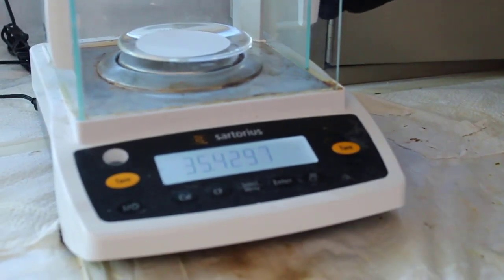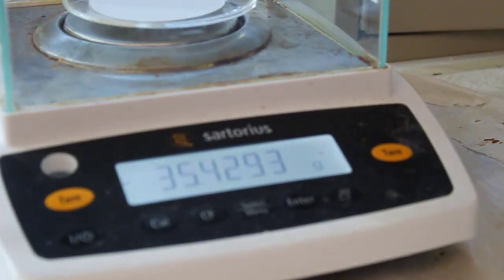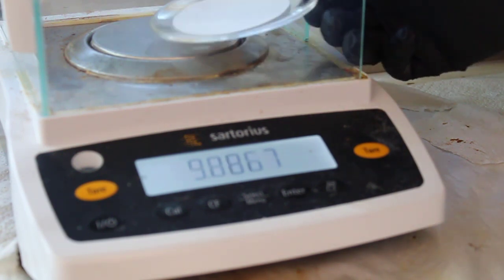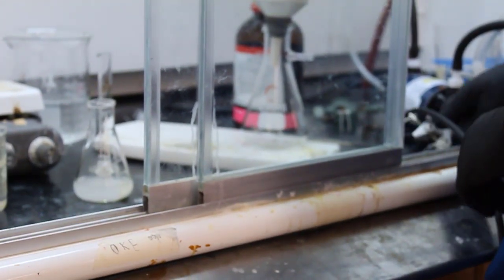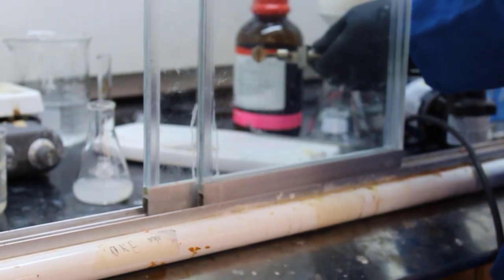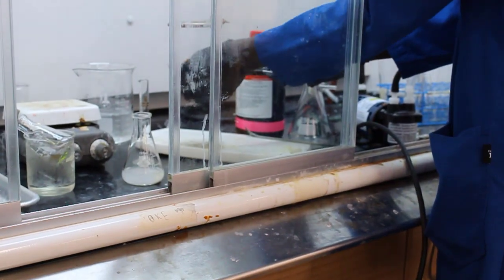They're going to weigh a watch glass and filter paper. Since they're the only ones in the lab, they just tare the watch glass and filter paper together. Now they're putting the filter paper into the Buchner funnel.